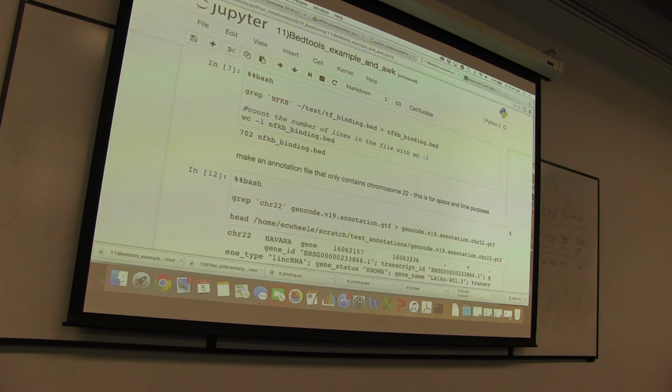All of that is telling your Jupyter notebook that's in Python to change the language to bash. So this code here is now in bash and not in Python. So just try to read it as bash. That's all that is. If you're just going to do it in that terminal, you can stay in bash. You don't need to tell it to be bash.